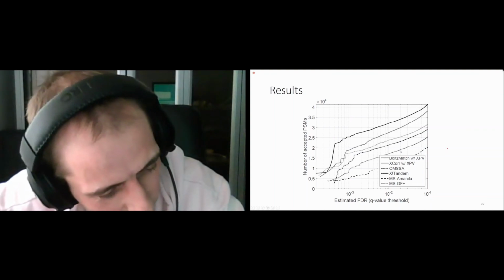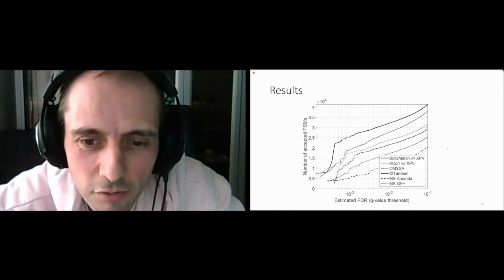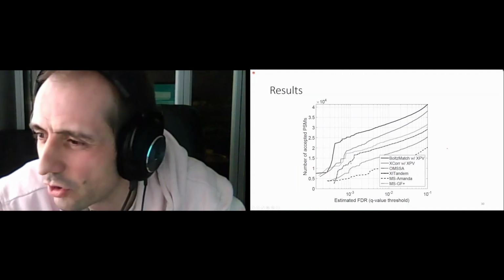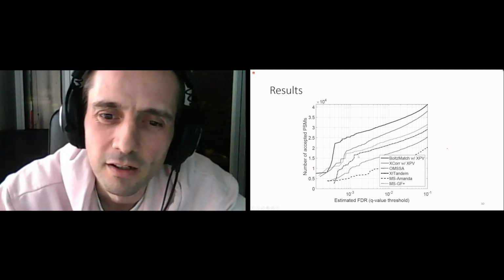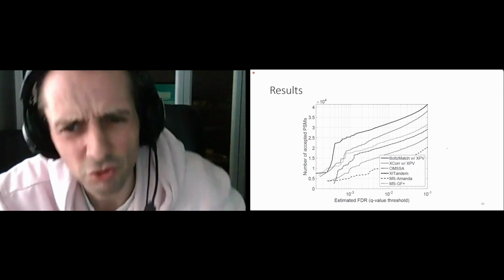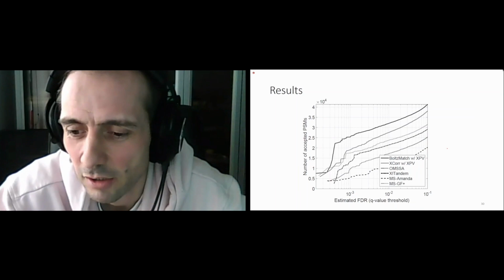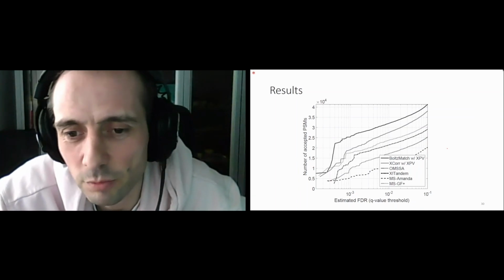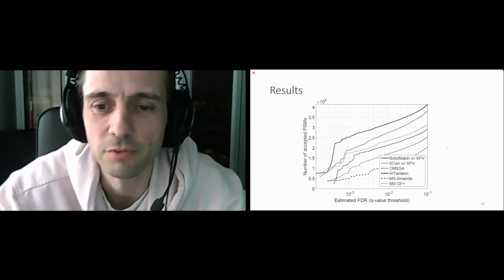This was developed by NIH and NCBI from the United States. X!Tandem is from Rockefeller University, I think, from New York, developed by David Fenyö. It's around 20 years old, and it uses a linear regression line to fit the slope of the empirical null distribution to calculate some e-value for the annotations.